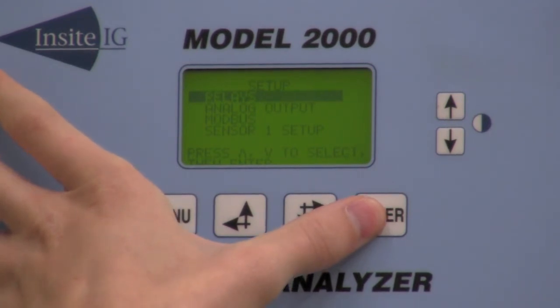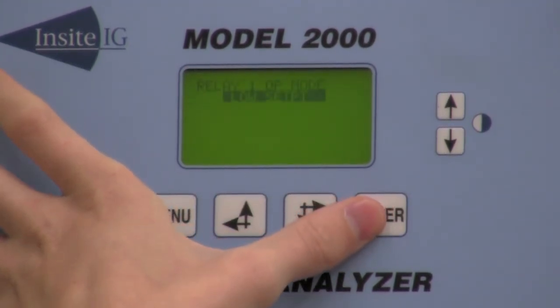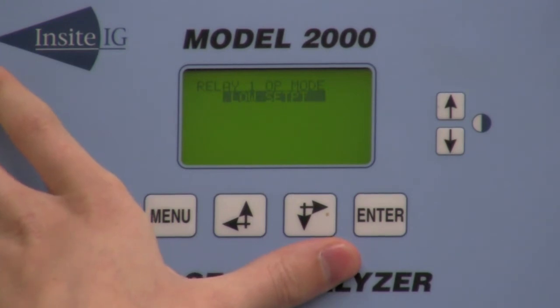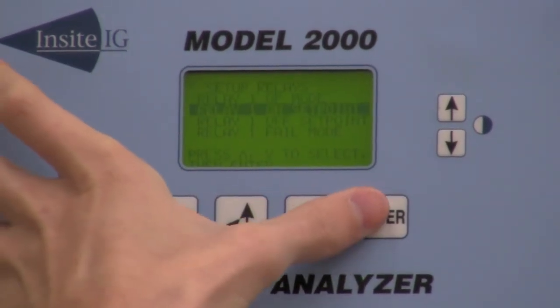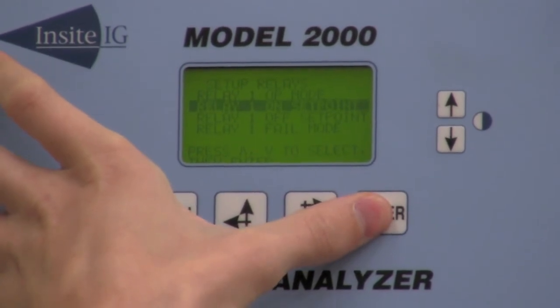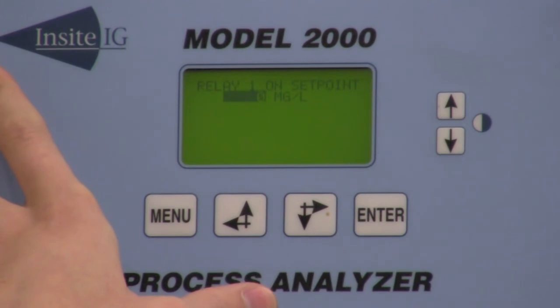This is where you're going to set up your relays, your 4 to 20 output, and Modbus communications if you choose to do so. The first thing we're going to do is set up our relays. You come into relay one operation mode where you can either have a low set point or a high set point. Then you come in and do your relay one set point — this is where you tell set point one to come on.